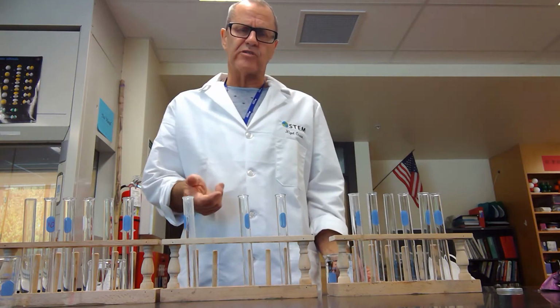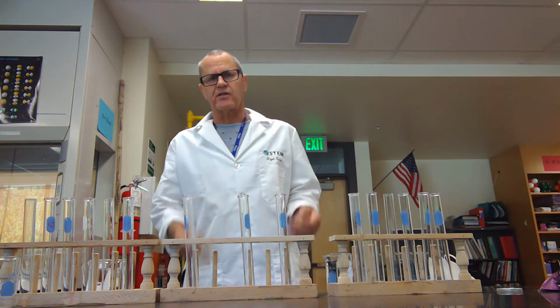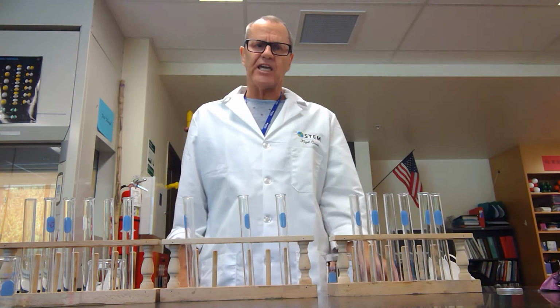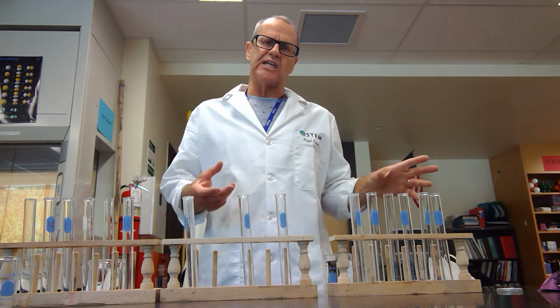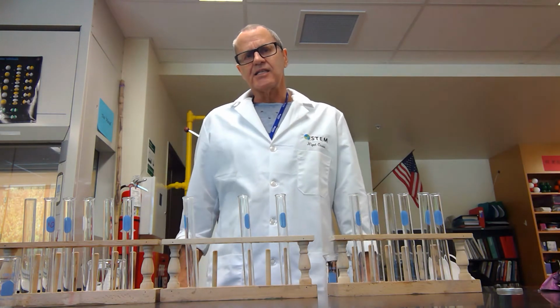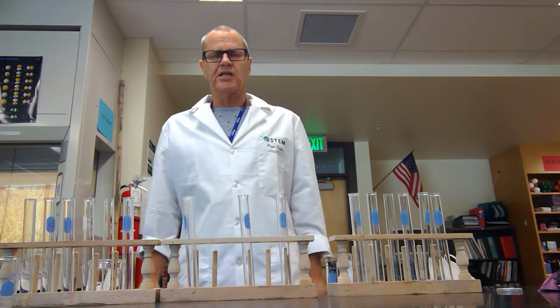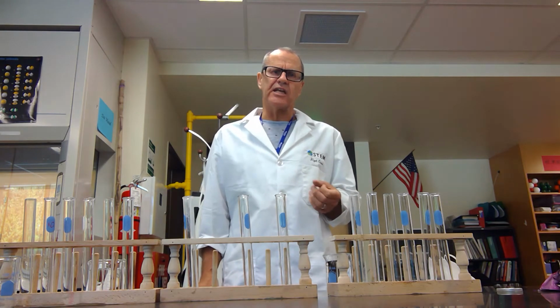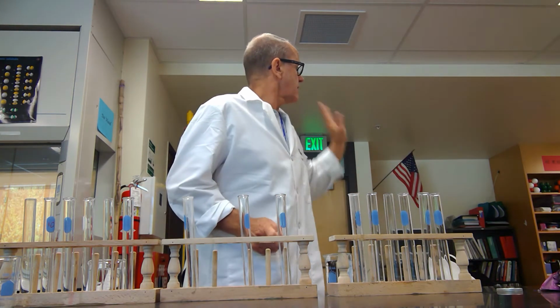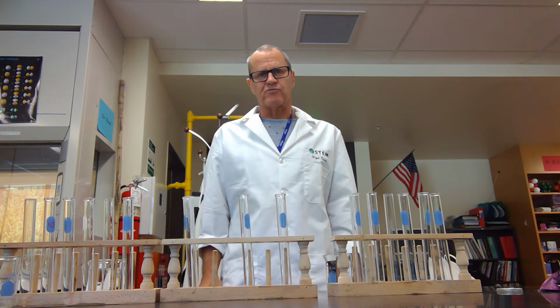Normally, in a chemistry experiment, maybe you might get a sheet of instructions and you follow those instructions brilliantly and you never make any mistakes because you're really, really careful chemistry students, and then you come up with some data and then you do something to that. This time, I'm going to do stuff. I'll talk you through what I'm doing, but you have to understand it enough to write a coherent method. And that method has to be so clear that anybody coming into this lab will be able to do what I have done and get the same results.